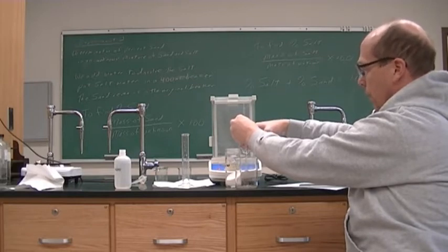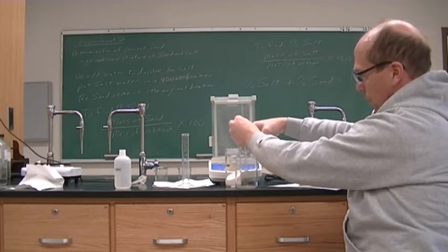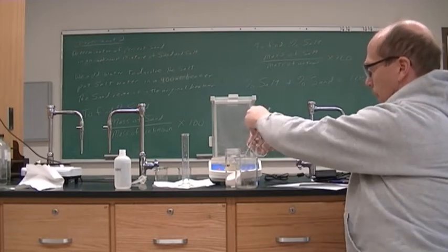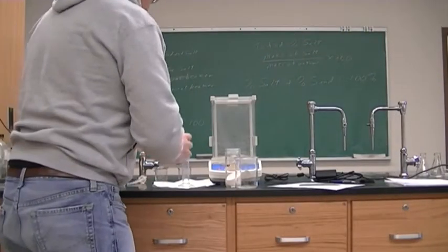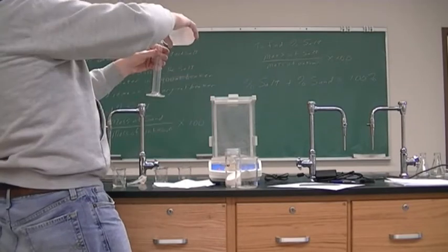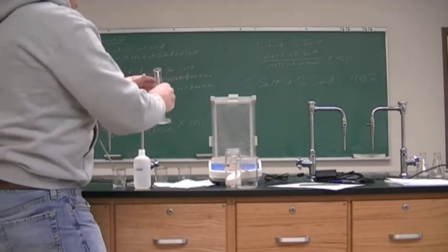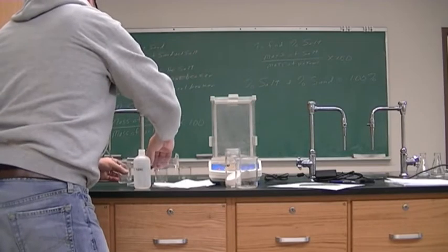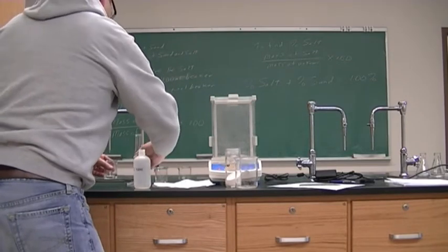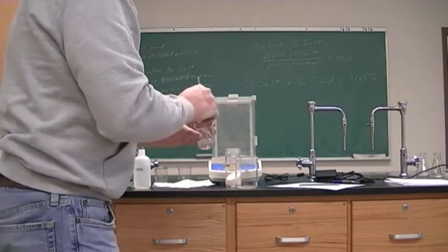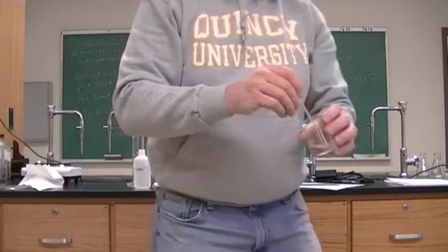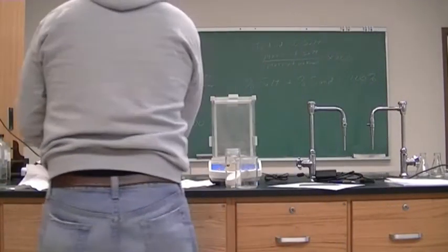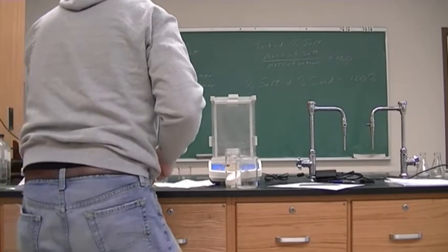I just want to get the liquid out and leave the solid behind. That was the first decant for beaker one. Now for the second round — put in a fresh 15 ml of deionized water and stir that up.